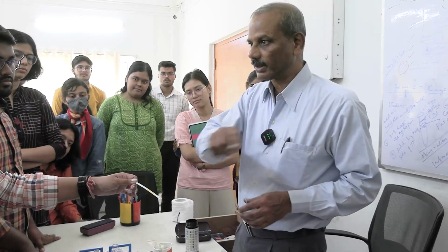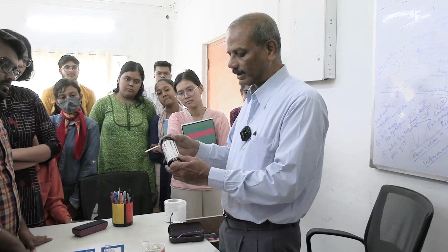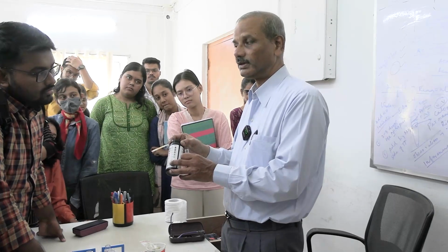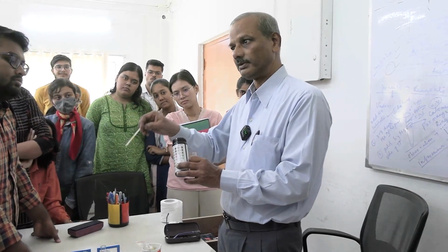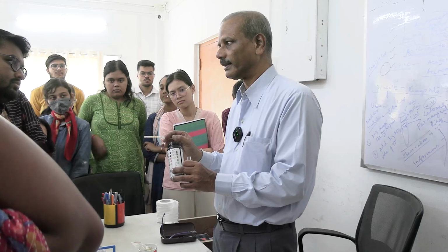Now by the time you return from the laboratory, almost 1 minute will have passed. So the time is calibrated here depending on the kit, whether it is 30 seconds or 1 minute. If it is 30 seconds, usually it is not allowed because you might come late. So that time it will be 1 minute. I will tell the person, just come as quickly as possible.